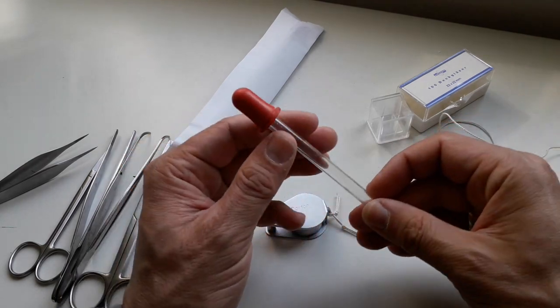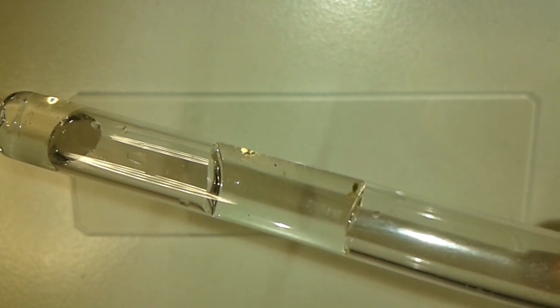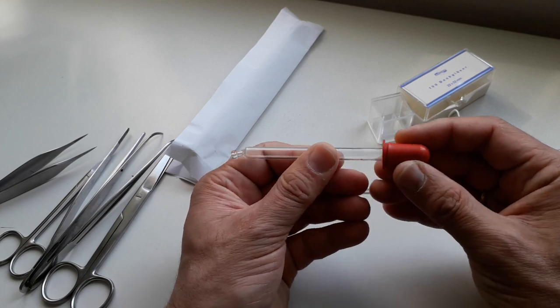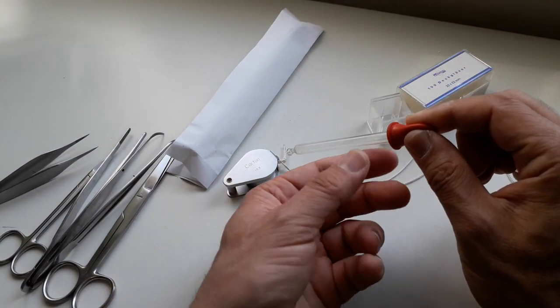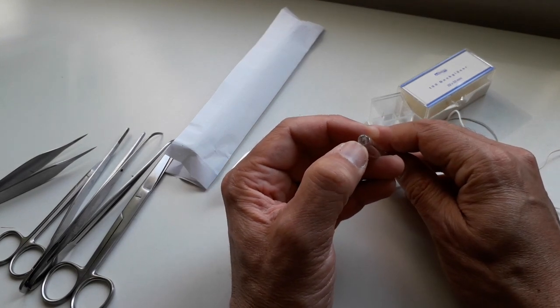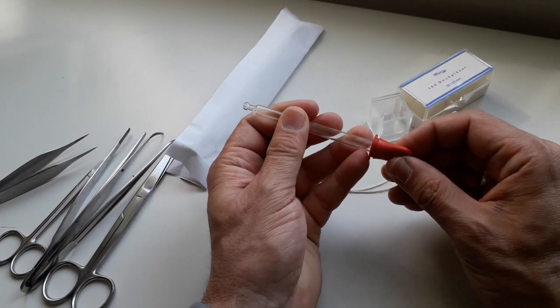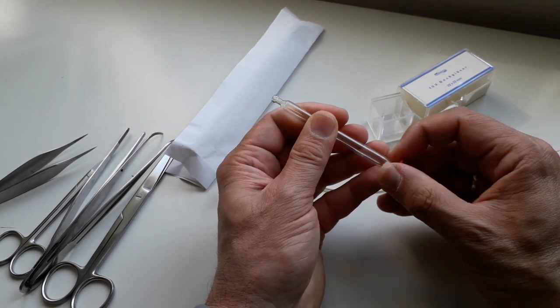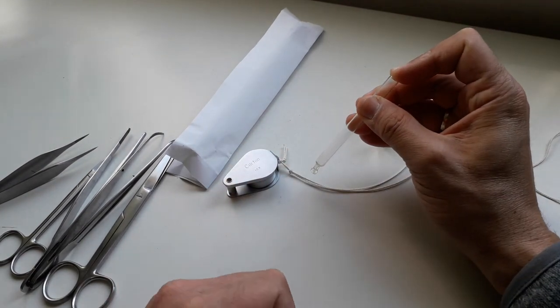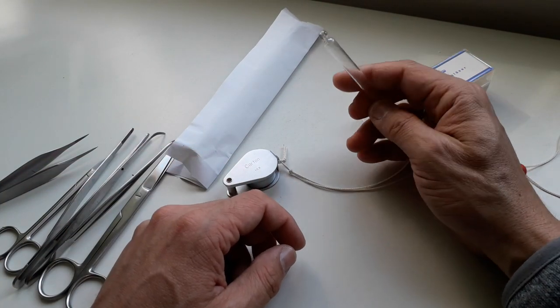The pipette I already showed you. This is very useful for catching water fleas and other small water crustaceans, because they're quite fast. What I usually do is go into the beaker and quickly suck it up, and the opening here is generally large enough to pick up the water fleas. If you do not want to use the rubber bulb here, you can simply take it off, hold it here, insert it into the sample, and then quickly release it, and the water rushes in and is also able to pick up certain specimens.